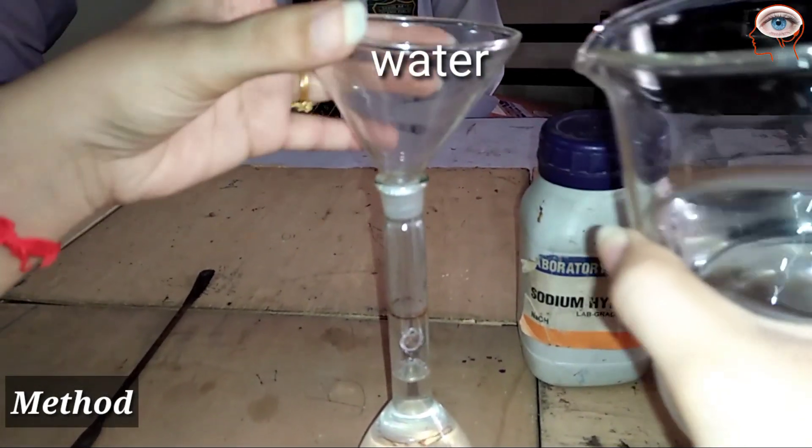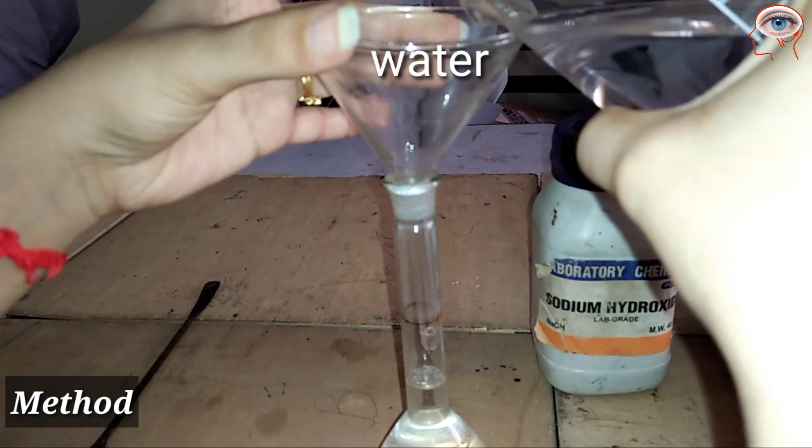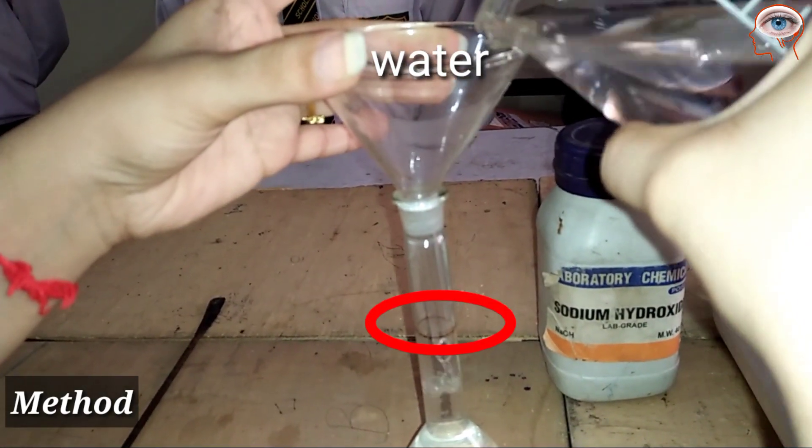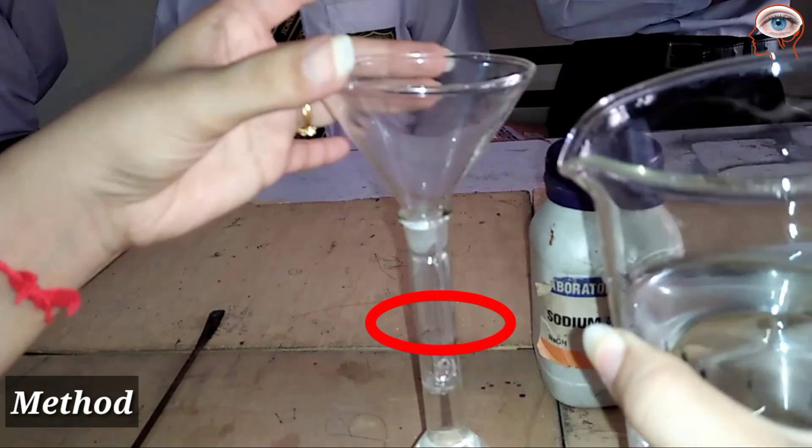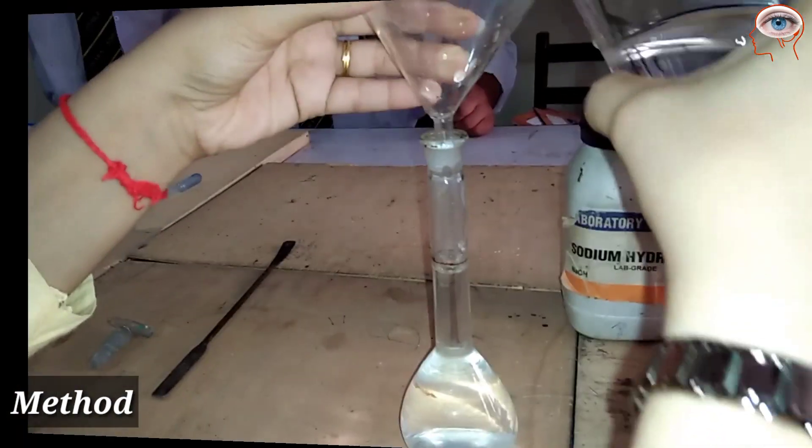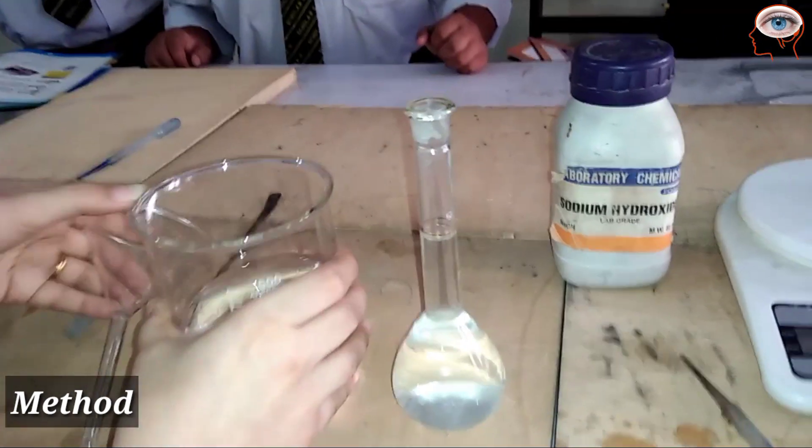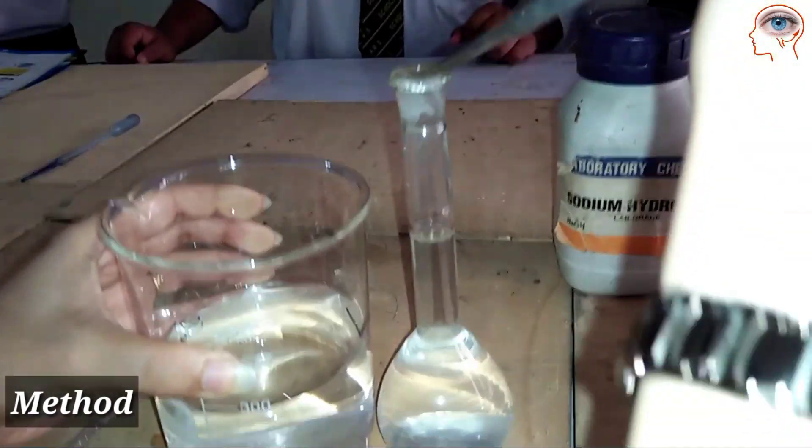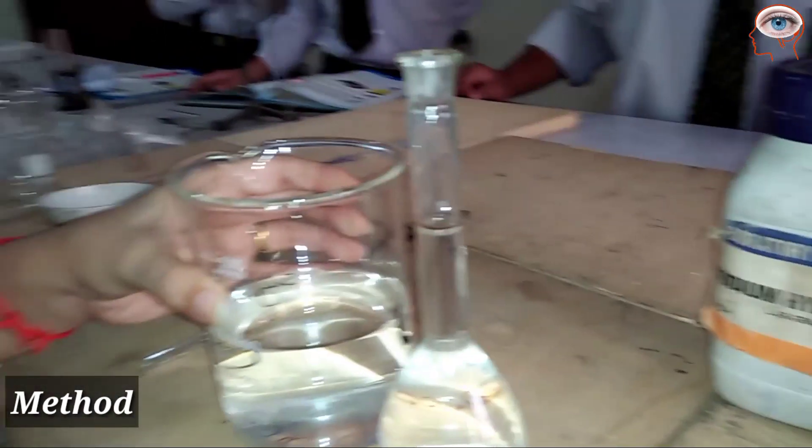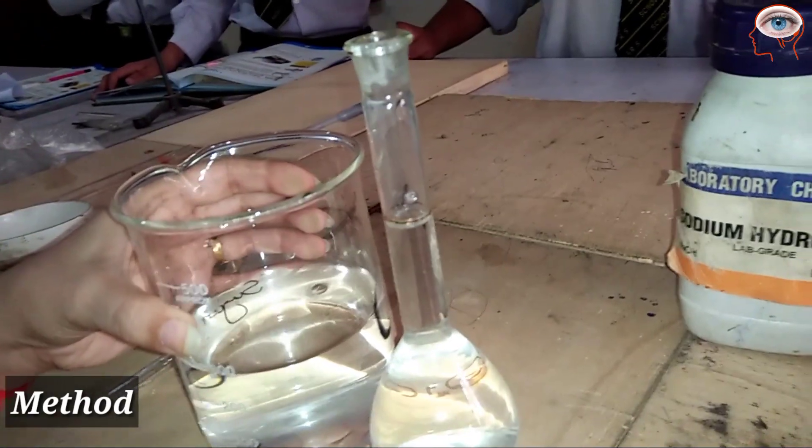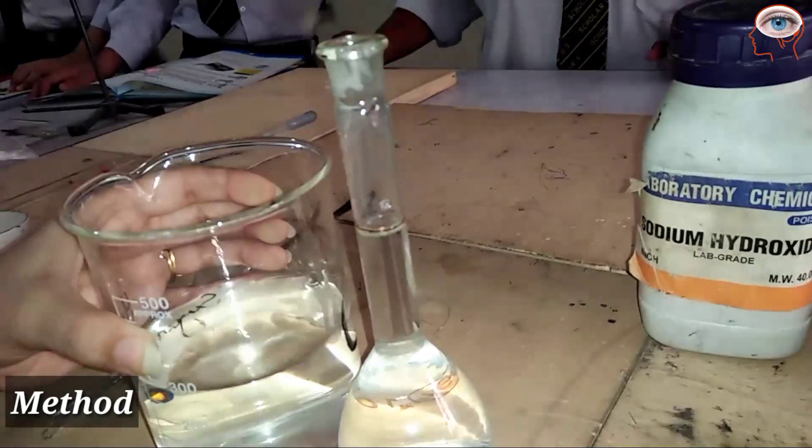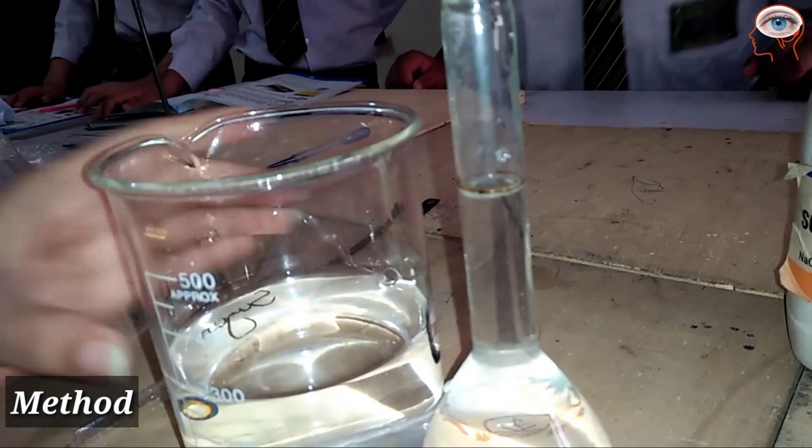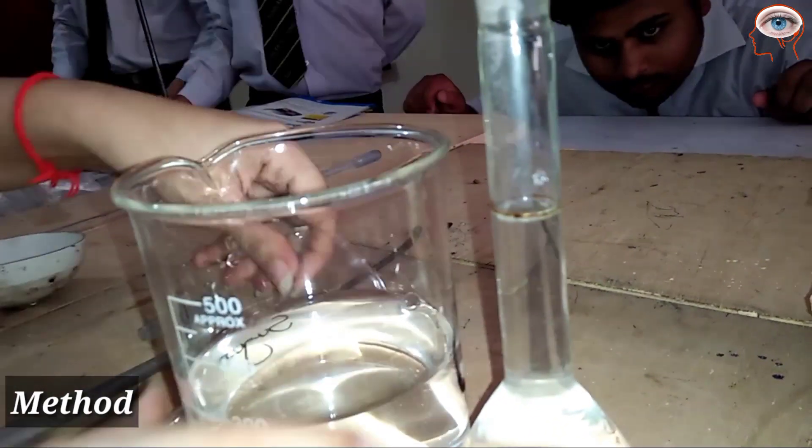Add water up to the mark at the neck of the flask. Use a dropper when close to the mark and add water drop by drop. The volume should not exceed the mark, otherwise the molarity of the solution will be disturbed.